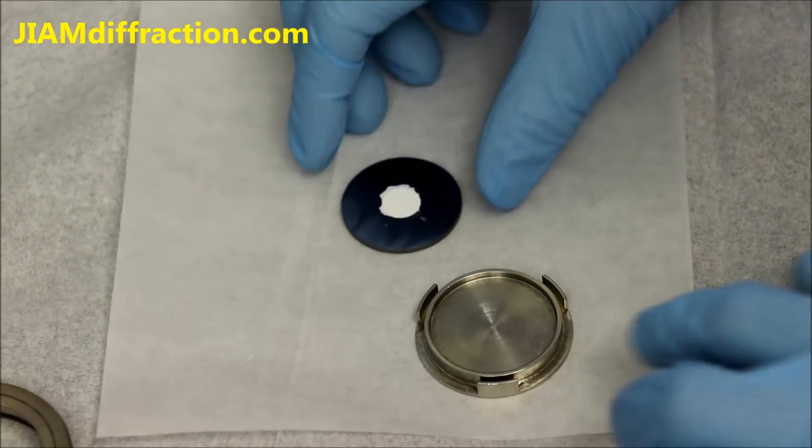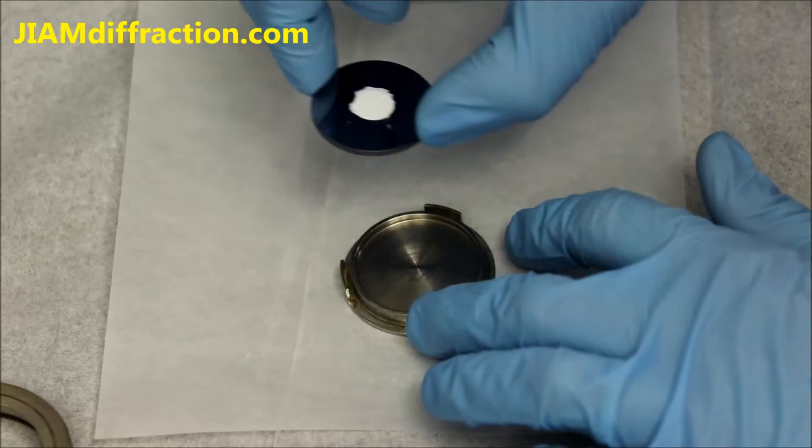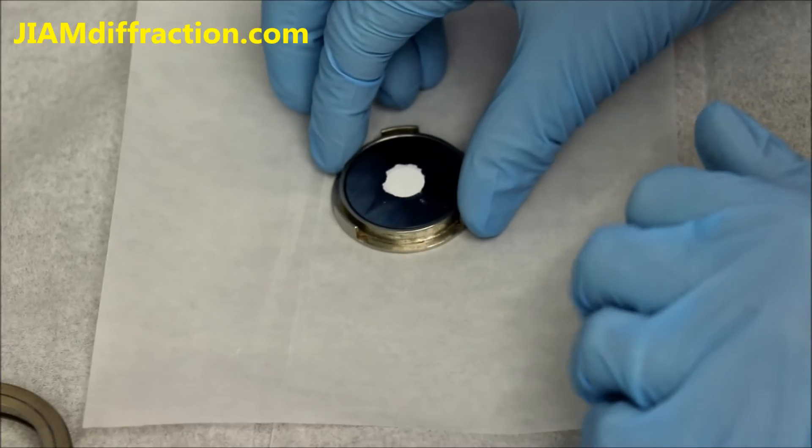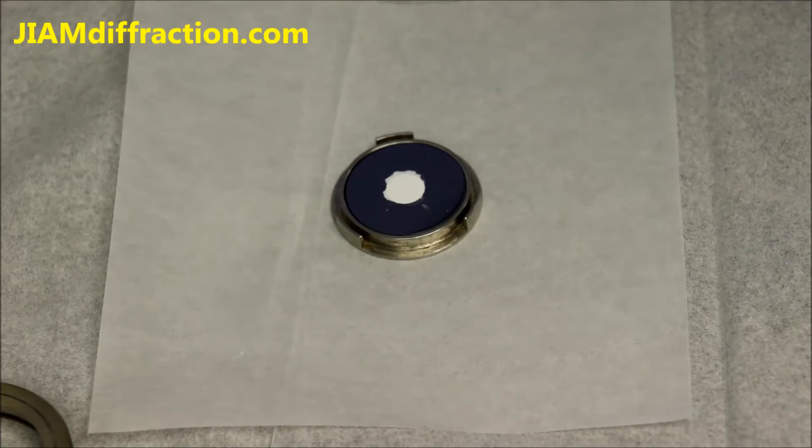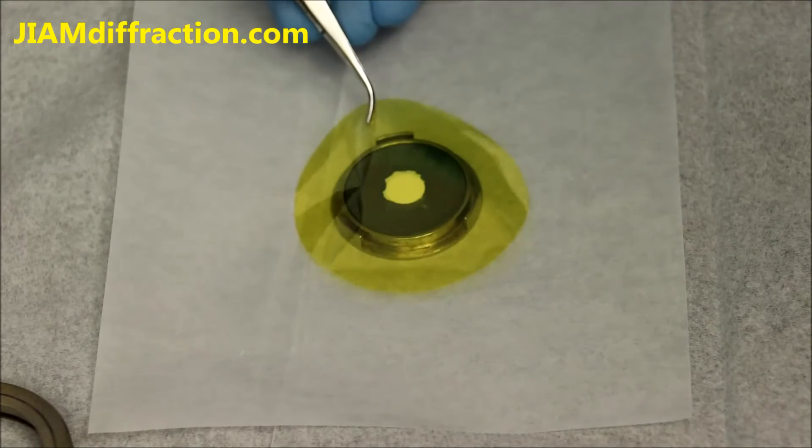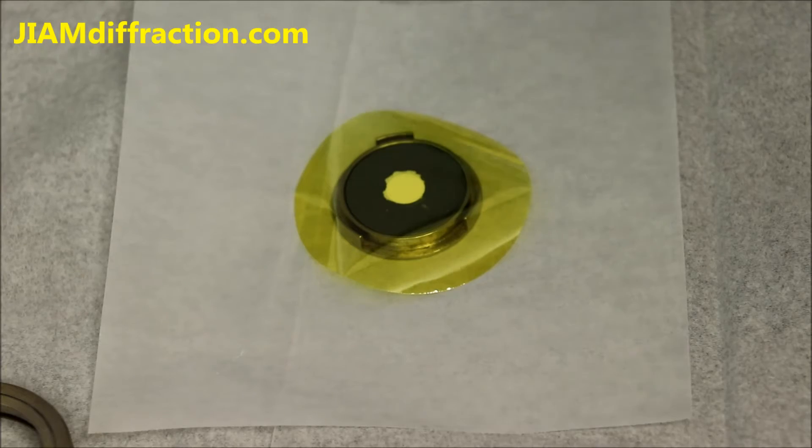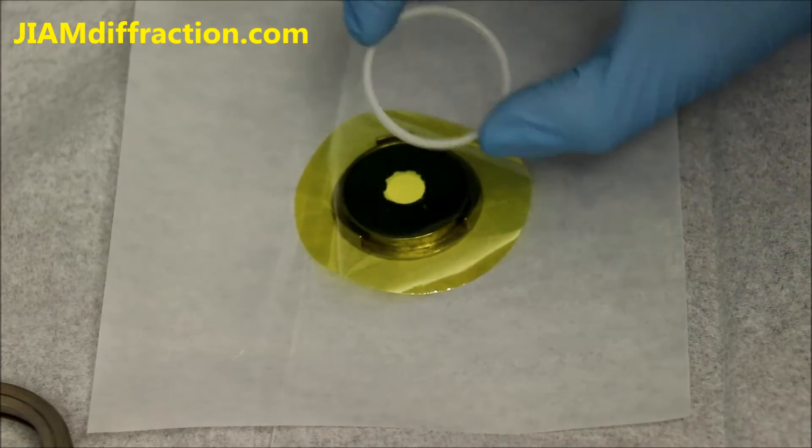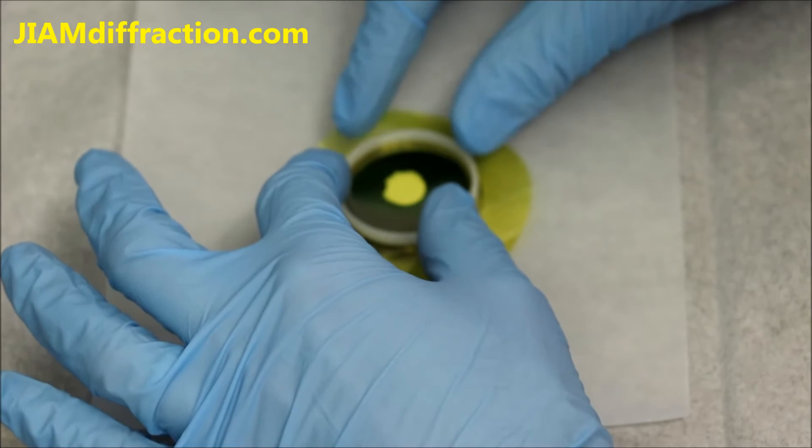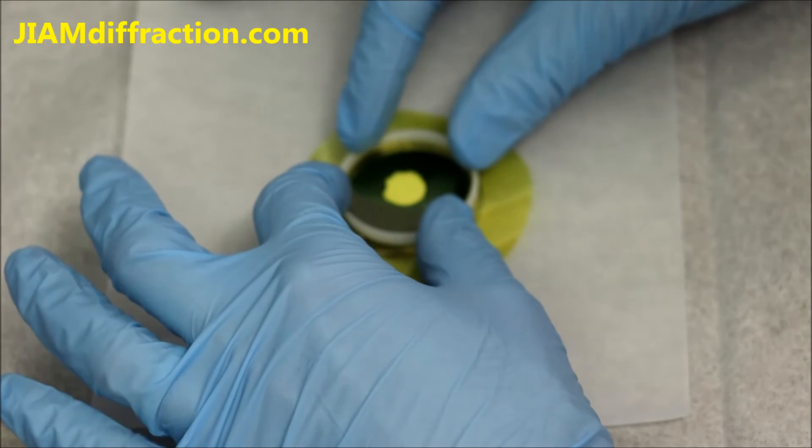So next we take this other piece and set the one we already prepared inside. We then take a piece of Kapton film which I have off camera and place it over the sample. We then take this ring, place it on top and then evenly press down.